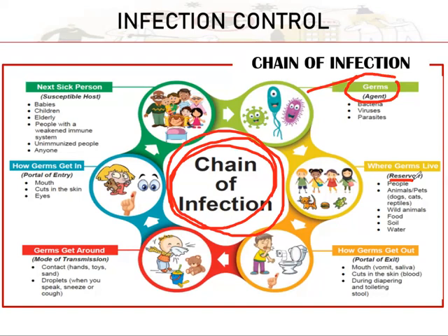That is why the very basic thing to break the chain of infection is through hand washing. It's because at this level pa lang, you already destroyed the reservoir of this pathogen, so you cannot further spread the infection. It's because you perform proper hand washing. So that is number one.